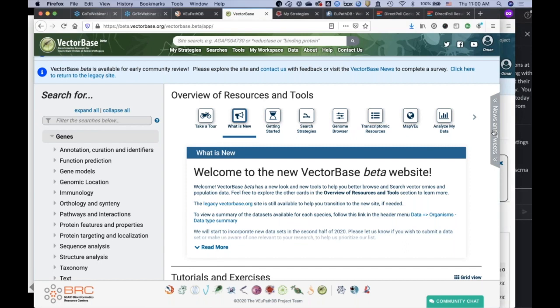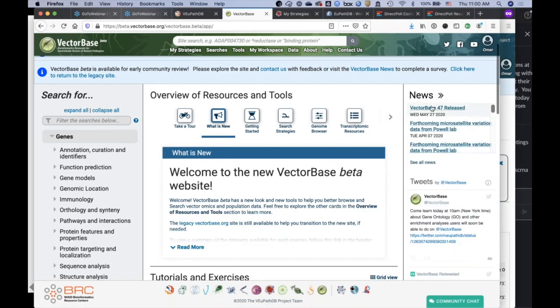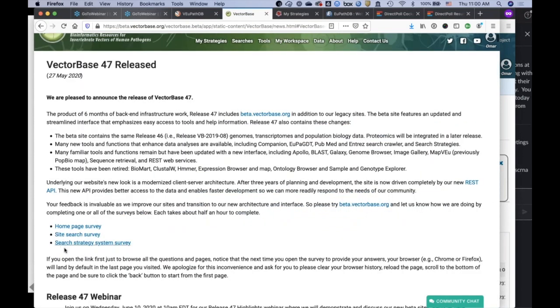And so in fact, we do have a number of surveys available. If you go to the news section of any of the beta sites, you will see that we have a few surveys available that we encourage all of you to go in and try out. This will do two things. One, it'll give you some training on the new resource, but at the same time, it'll give you an opportunity to let us know if we got things right, if things are working properly, if things can be improved, and any other suggestions you may have. So these are quite useful, and you'll be hearing a lot more about these, but I certainly encourage all of you on this call to try these out and give us your input.